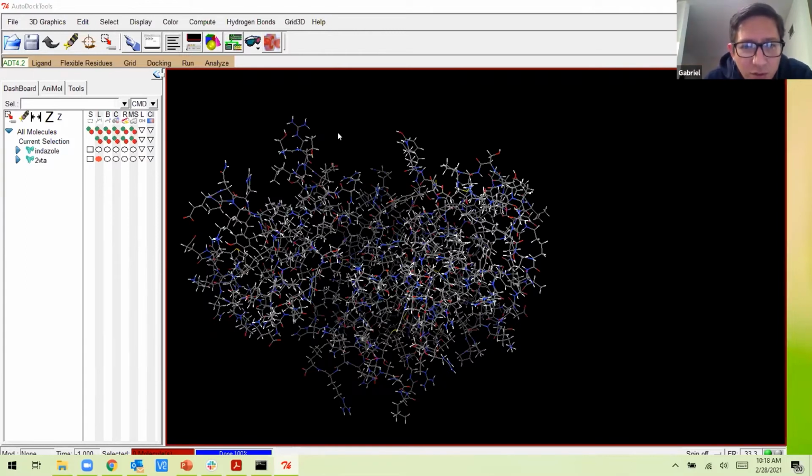Another question: what is the difference between choosing all hydrogens or polar only? Do you know what will be the difference, Jesus? I believe it should depend on what you want to add. I mean, it's better to add all hydrogens because polar, I think, only adds to particular amino acids. Yeah.